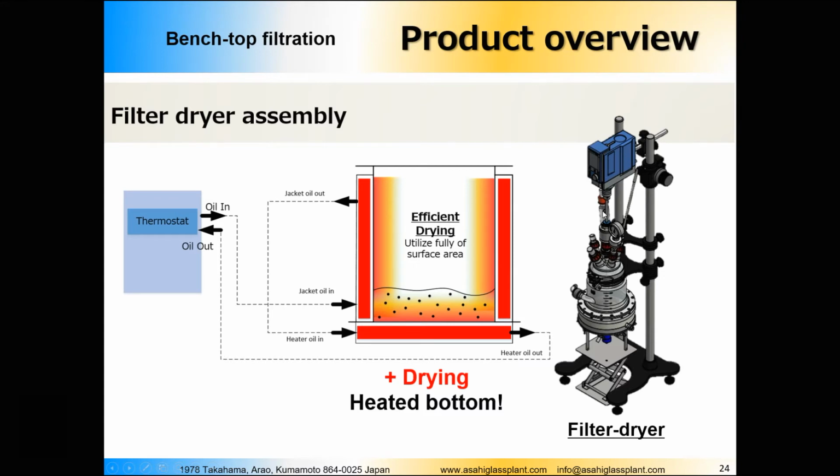We have the overhead stirrer here, but not the manual stirrer, because if we want to stir manually, we will get pretty big pieces of the dried media, and this is something that no one needs. Plus the filtration process, the drying process will not be that efficient, because we will already dry the lower part, but the upper part over here will still be relatively wet.